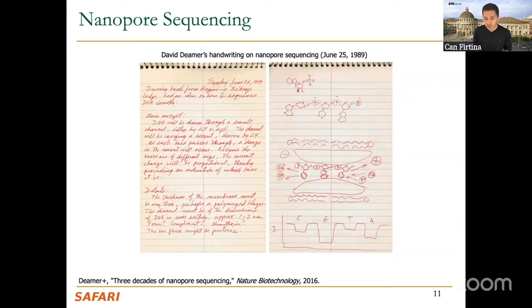essentially read the ionic currents, or the charges that are attached to each base in the DNA? Can we create an environment so that the charges in the DNA disrupt the ionic current flow around the region where this DNA would be moving, so that this disruption would be informative for us to tell what sort of base is moving at that particular time?